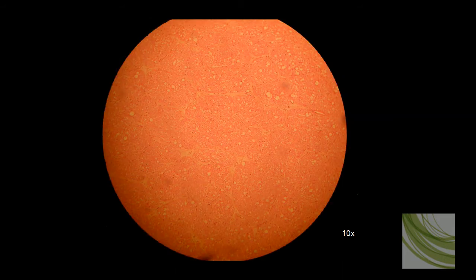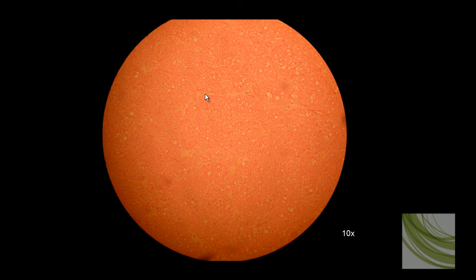Here is that same slide using the 10x objective. The little endoneuriums holding the myelinated axons are a lot clearer at this magnification. The fascicles and the perineuriums are not nearly as clearly stained in this slide, but you can kind of see them here using the 10x objective.